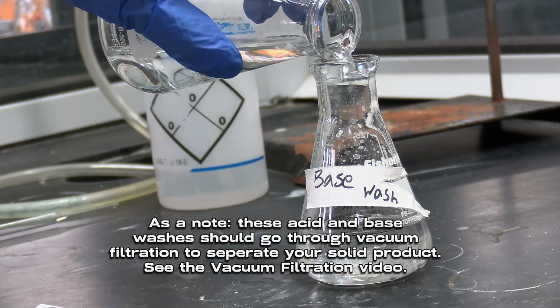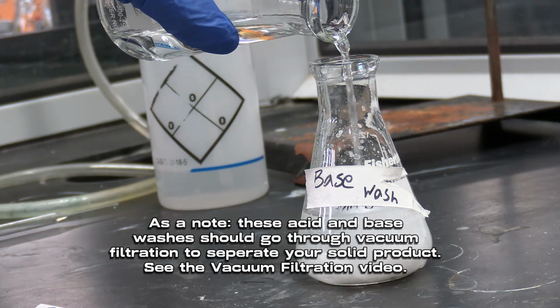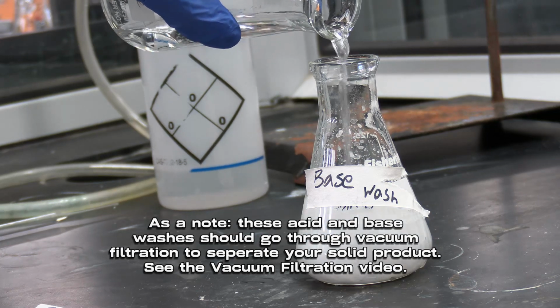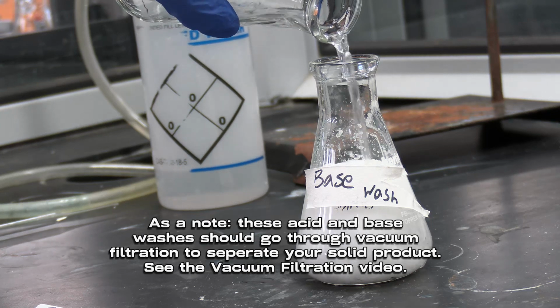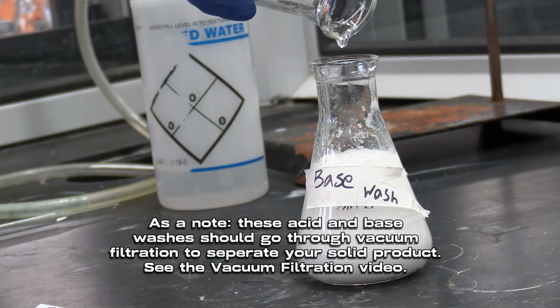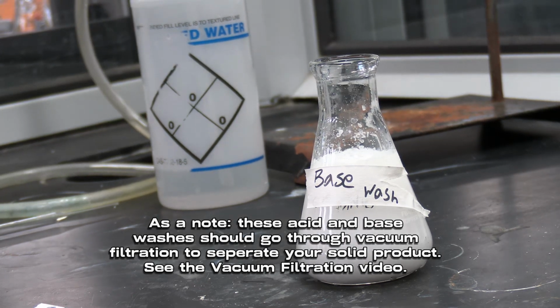As for why we added 6 molar HCl to 3 molar NaOH, it turns out you need an acidic solution to convert benzoate to benzoic acid, as its pKa is around 4, which means it's half protonated at pH 4 and will only be fully protonated below this pH. If not enough of either acid or base is added, the precipitate will not fully form.